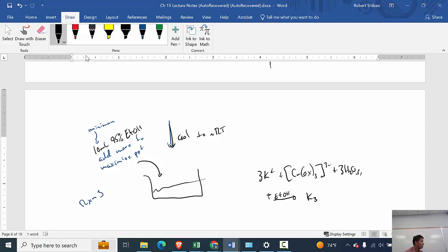This is going to be K3CrOx3·3H2O solid. And so we're going to make the solvent more ethanol-like and less water-like, to facilitate that. And so the more ethanol we add here, the better. The only thing we have to worry about is co-precipitation.